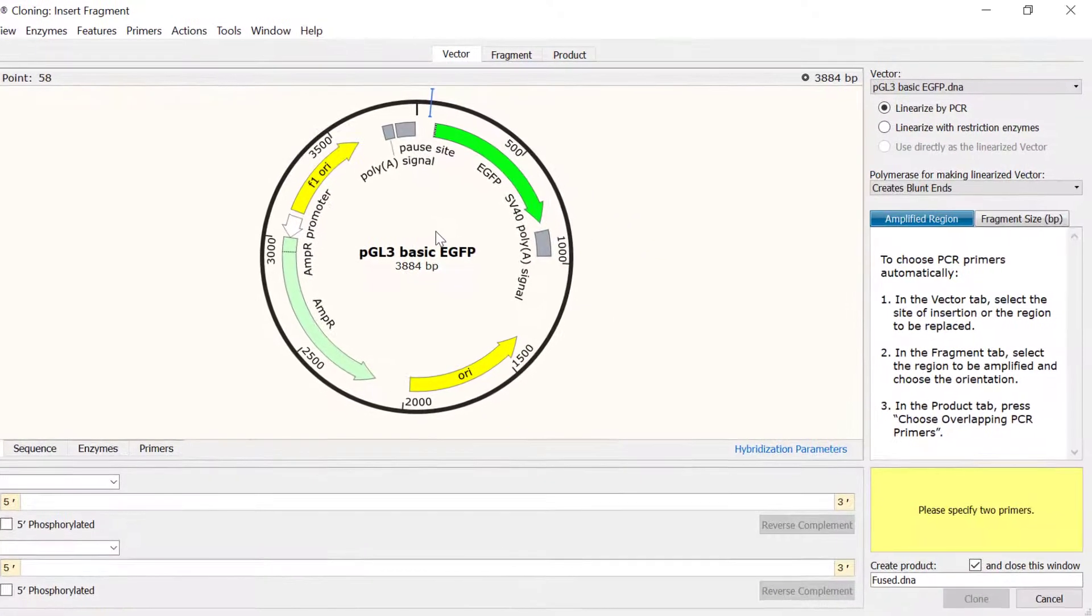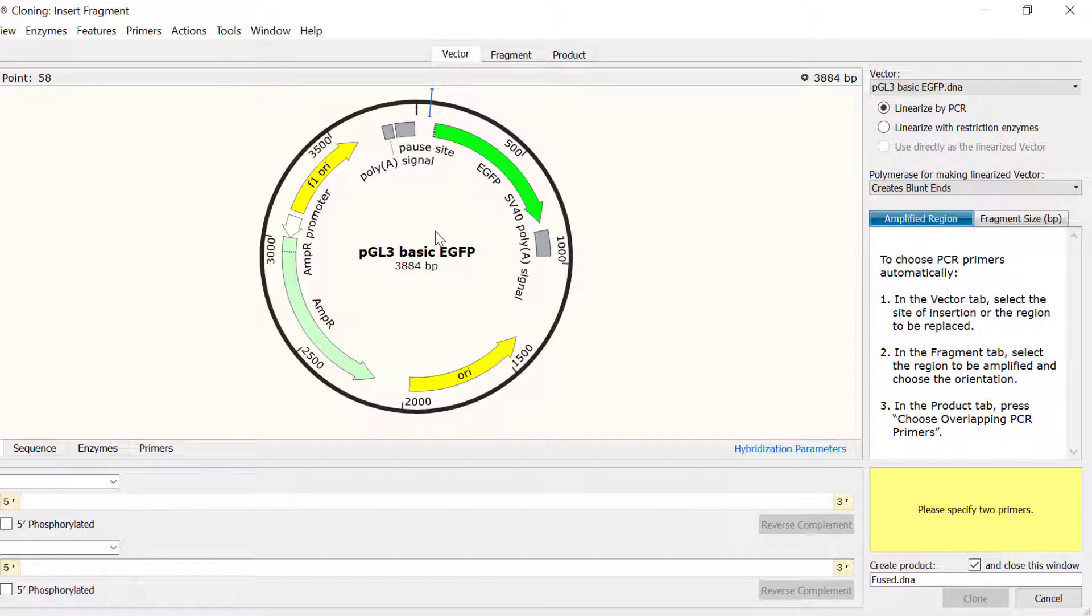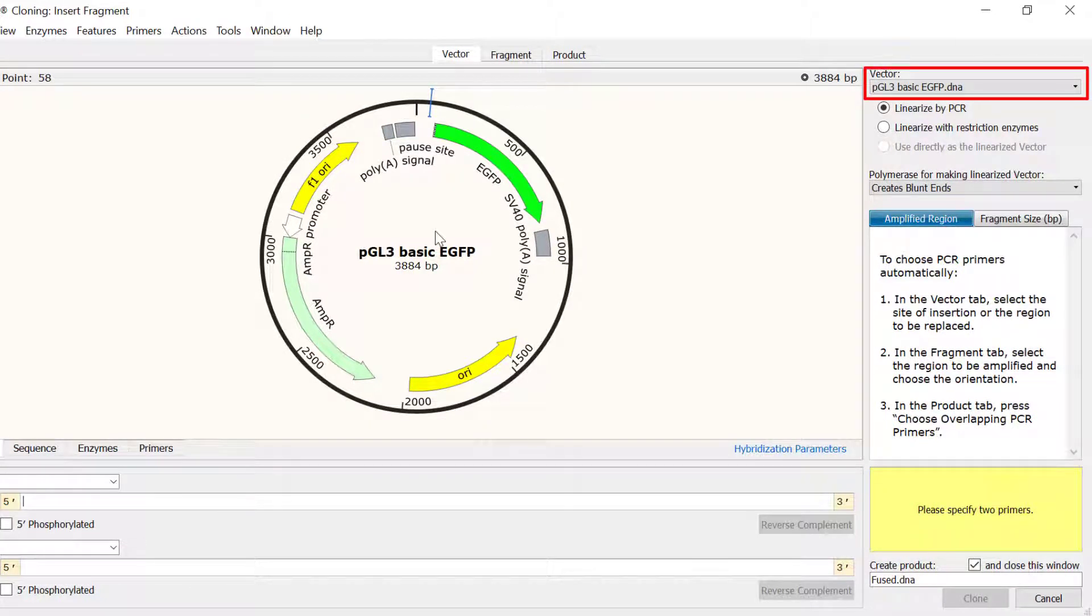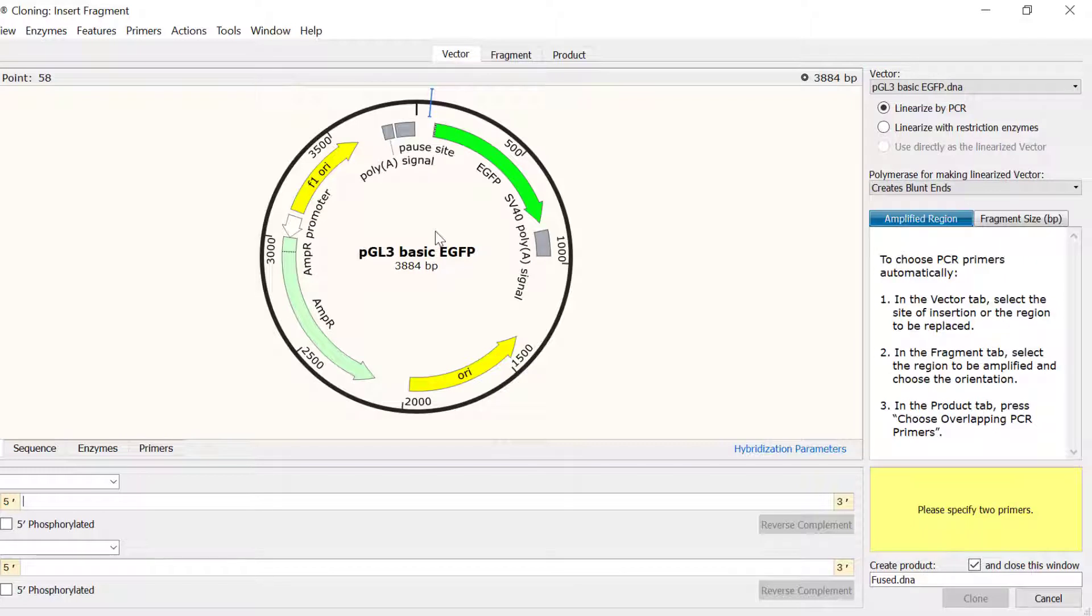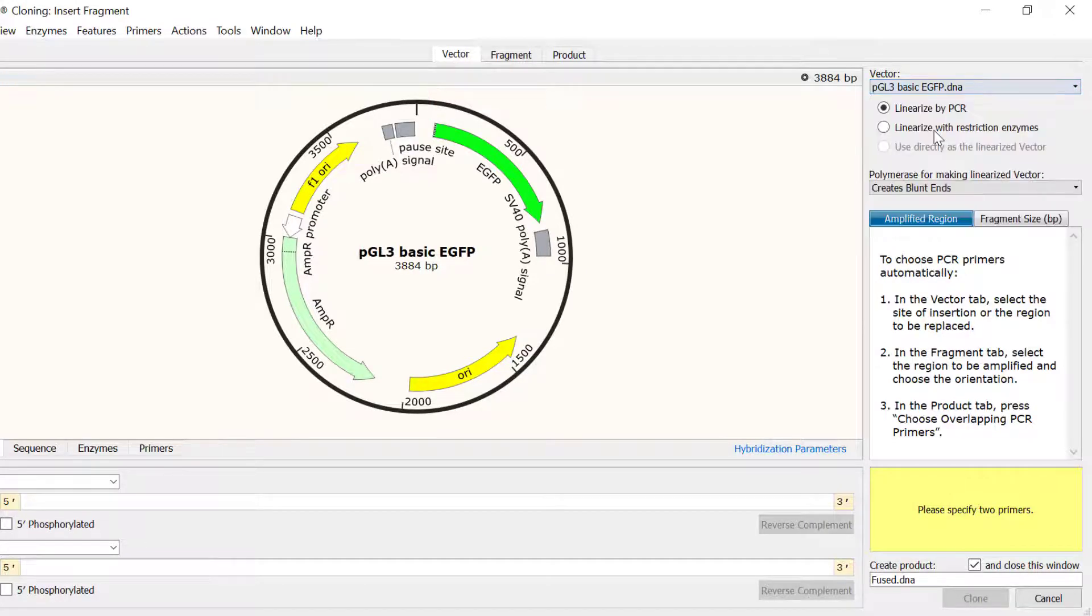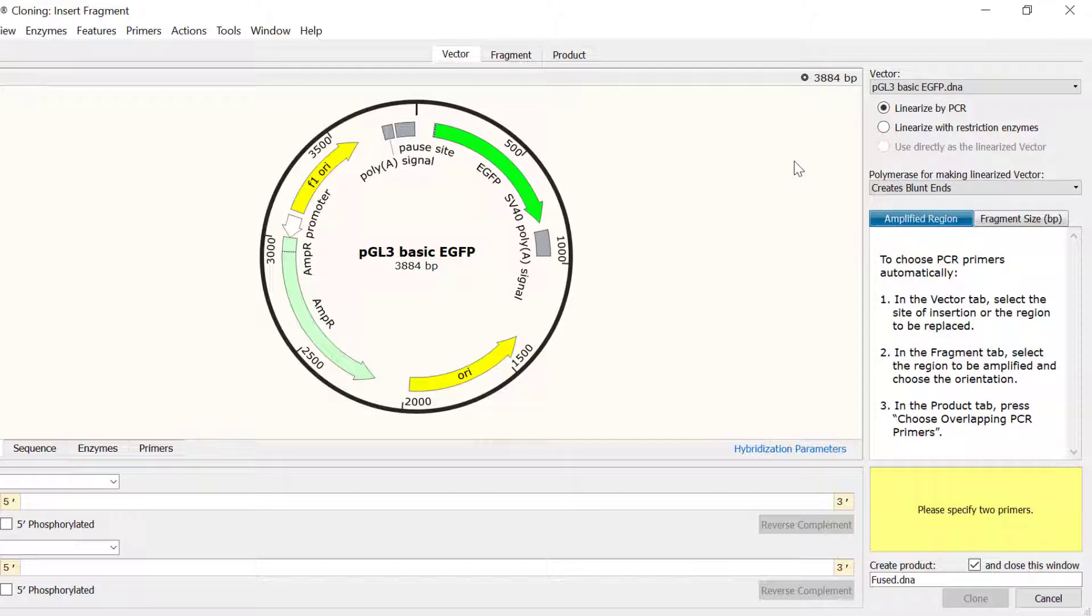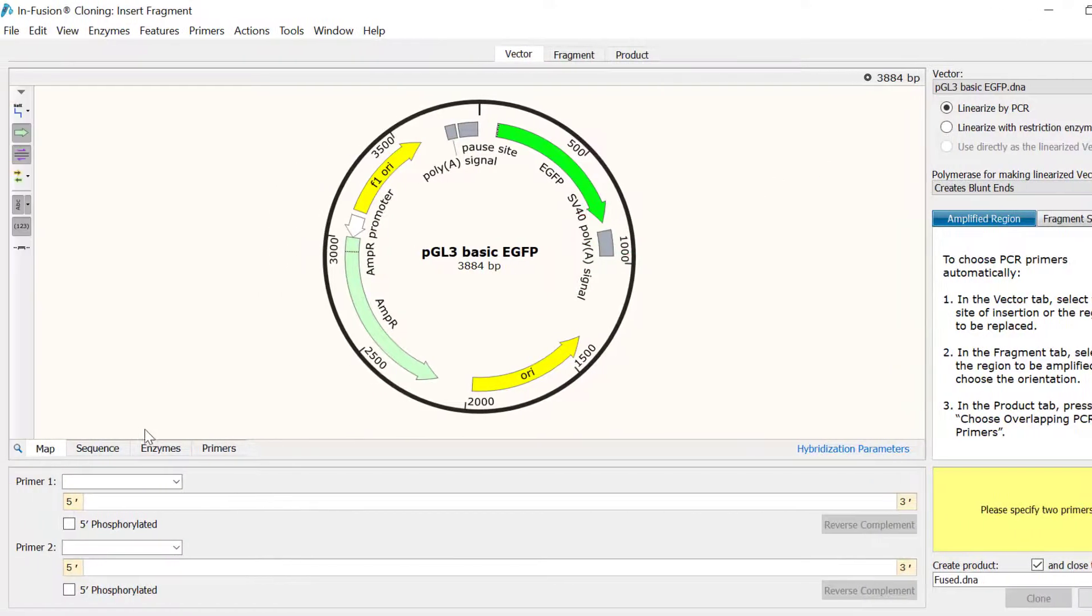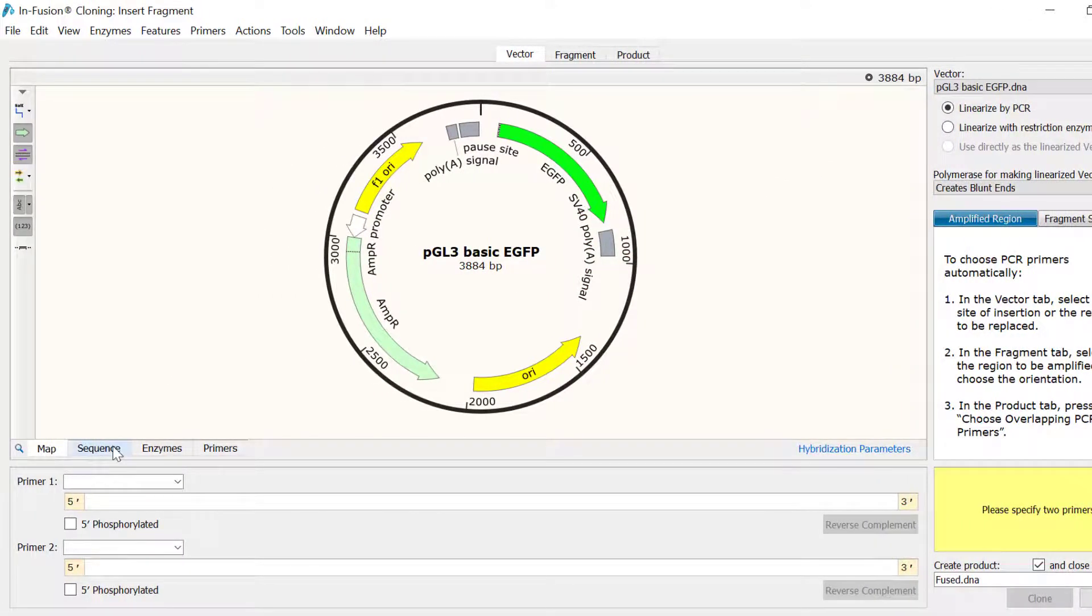In the first tab named Vector, I need to specify the vector file. Snapgene automatically enters the sequence that we were looking at when we opened the infusion cloning window, so this is the PGL3 plasmid. You can use the vector dropdown menu to select a different file. I now need to select the region in the vector where I want the BDNF promoter to be inserted. To do this, I will switch to the sequence view.